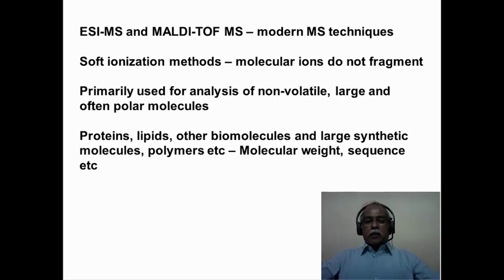Large synthetic polymeric materials also can be analyzed using this mass spectrometry technique. One can do, for example, molecular weight analysis, as well as in the case of proteins and DNA, one can even do sequence analysis in terms of the primary structure of these macromolecular systems.